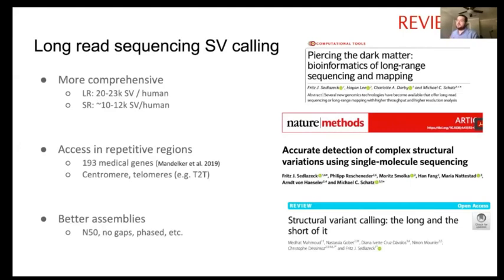positive identification. Long reads also enable access to repetitive regions, highlighted here in 2 or 3 works already, as being important to assess medically relevant genes such as LPA and HLA, which we are almost blind to with short reads on their own. They also contribute to better assemblies, for example, the T2T work that is currently going on.